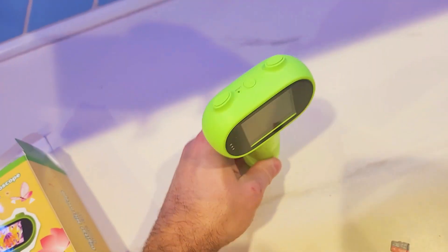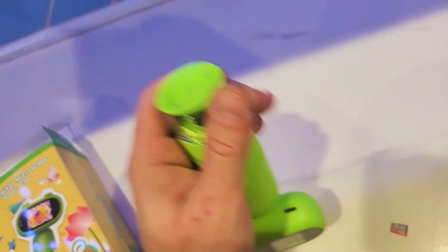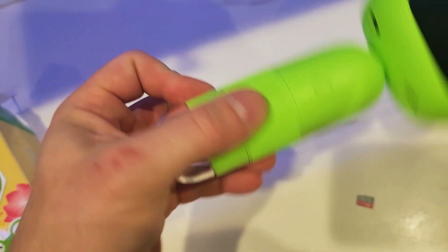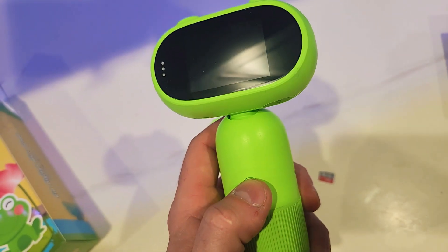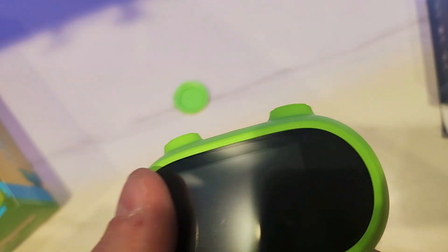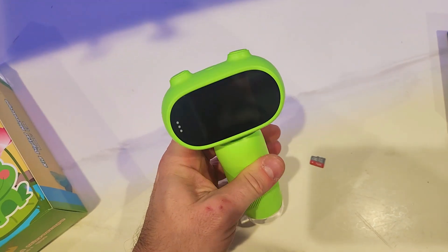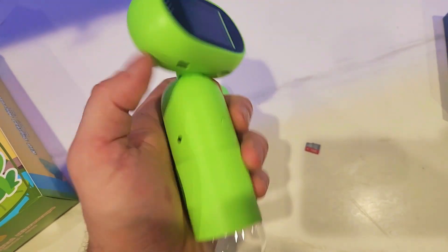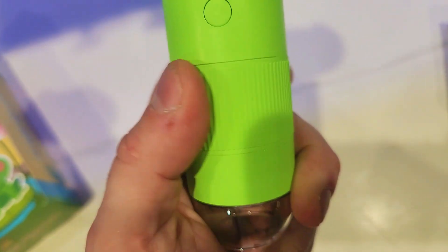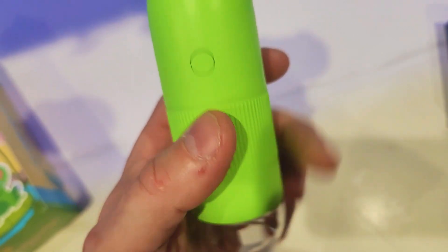It's got a base so it does stand on its own. You remove this cap — it's a protective cap for the LED and the actual microscope. The power-on button is right here. You hold this for 3 seconds to turn on, and then hold it for 3 seconds to turn off. You can adjust the tilt of the screen as well, so if it's not comfortable this way or that way, you can adjust and tilt it. There's an additional focusing ring — you turn this ring this way or that way until you focus.